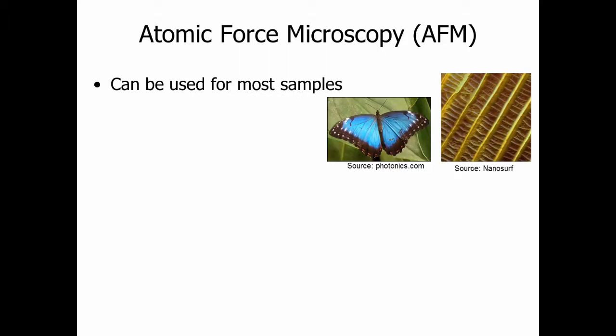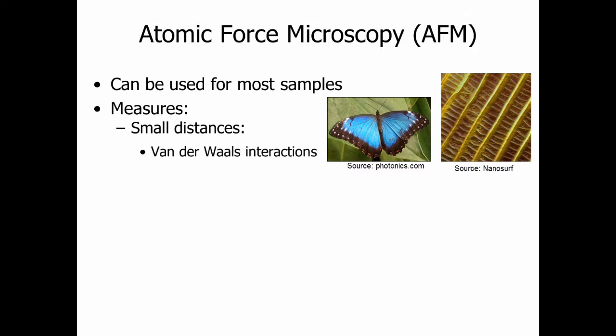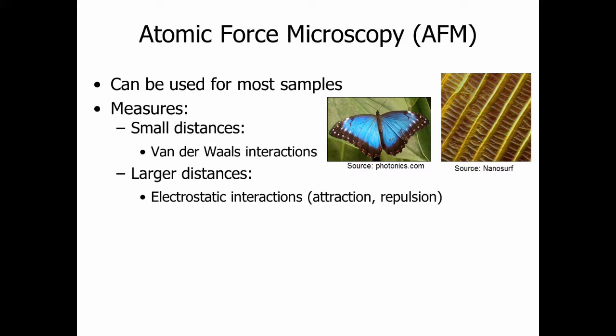And then finally, atomic force microscopy. It's great because you can use it for pretty much anything. You don't even have to sputter coat it. It measures very small distances. It involves van der Waals interaction, so electrostatic forces.